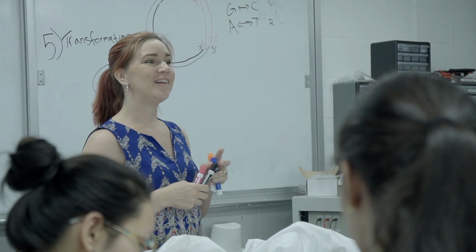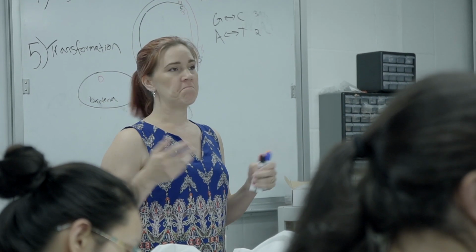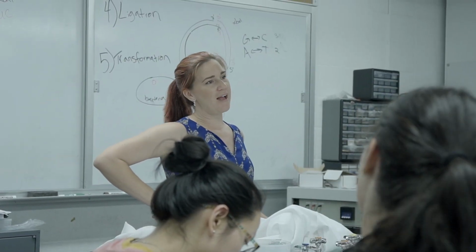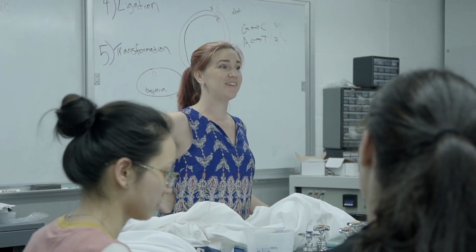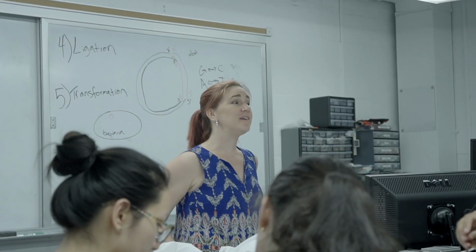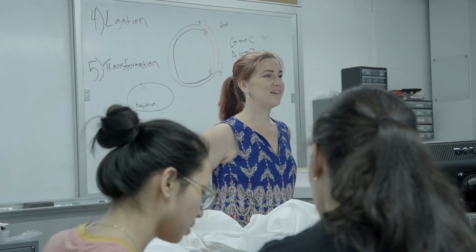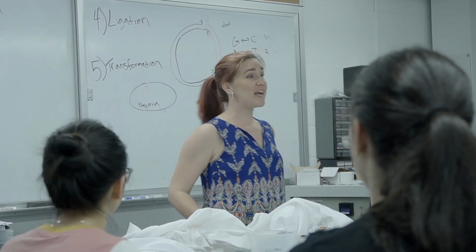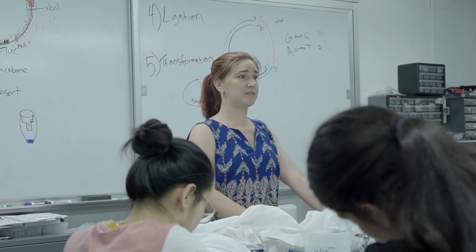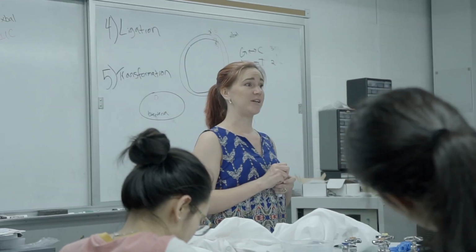Yes? So you're saying 2 minutes. Why specifically 2 minutes? Because I know people do different times. Yeah, it would depend on the strain of the bacteria, and I would say it's pretty robust. Sometimes it's as fast as a minute. Basically, you don't need to do it for that long. Have you done a different protocol? Yeah, I did it 2 weeks ago, and you did it for 50 seconds. For 50 seconds. So it's probably a better strain of bacteria than the one I use, that responds to the heat much faster and takes in DNA much faster.